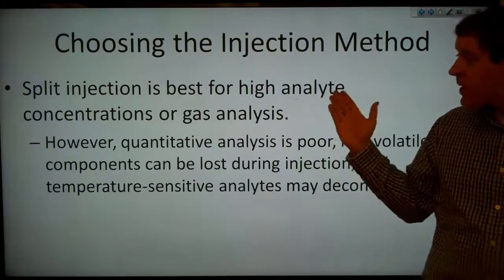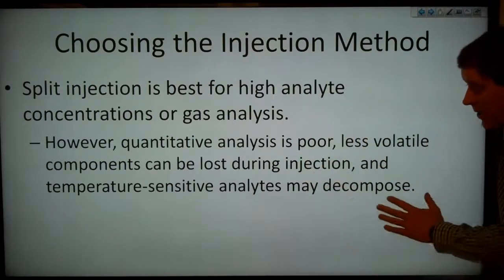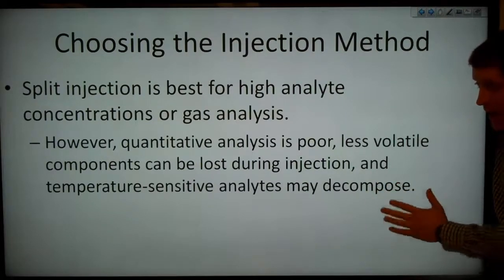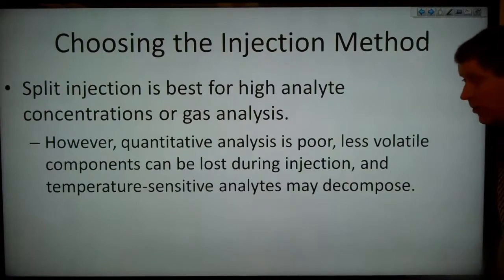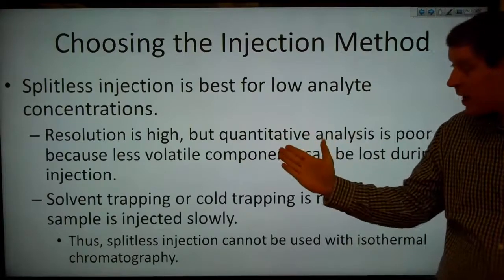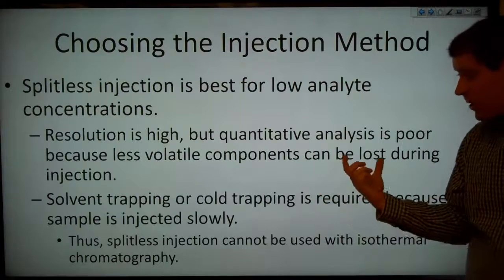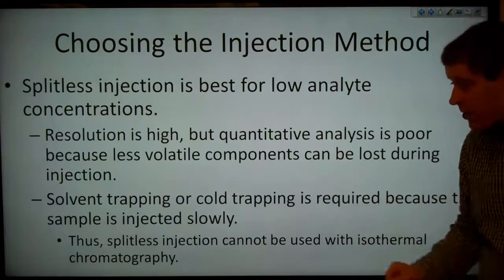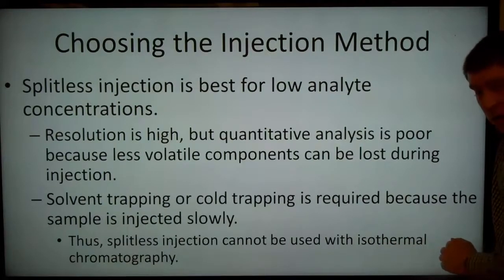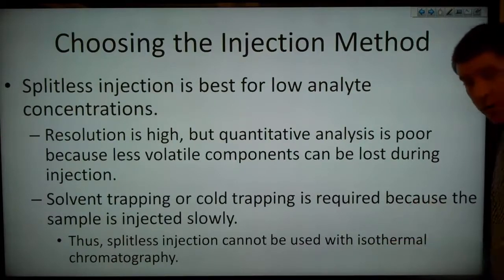The split injection is best for high analyte concentrations or gas analysis. However, quantitative analysis is poor, less volatile components can be lost during injection, and temperature-sensitive analytes may decompose. Splitless injection is best for low analyte concentrations. The resolution is high, but quantitative analysis is relatively poor because the less volatile components can be lost during injection. The solvent trapping or cold trapping is required because the sample is injected slowly. And thus, splitless injection cannot be used with isothermal chromatography.